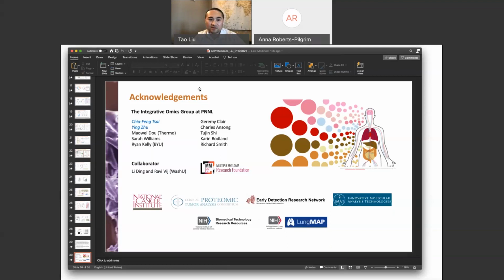Let's go with this one. Which tool is suitable for single-cell proteomics analysis? This particular person uses Seurat for single-cell RNA-seq. What would you recommend?